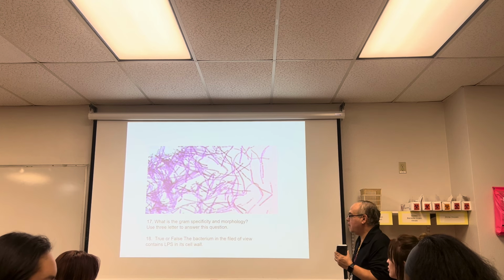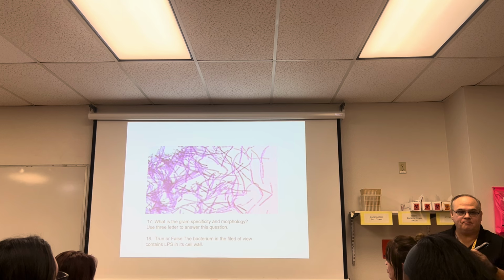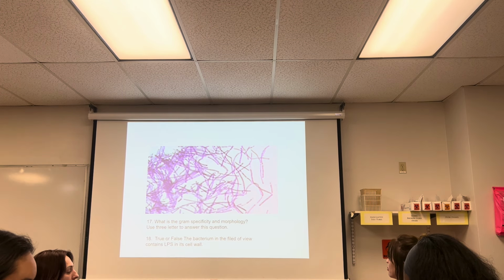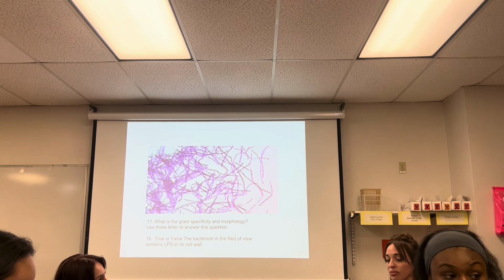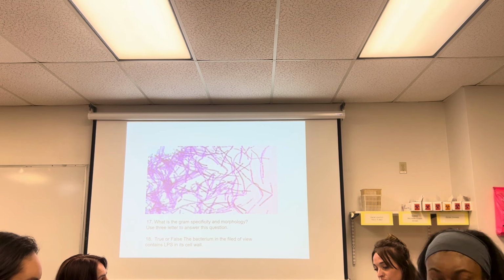Good. True or false, the bacterium in this field of view contains an LPS in its cell wall. False. It's Gram positive, there is no LPS. And I don't need you to explain it. I just need true or false. And you need to write out true or false. All right, here we go.